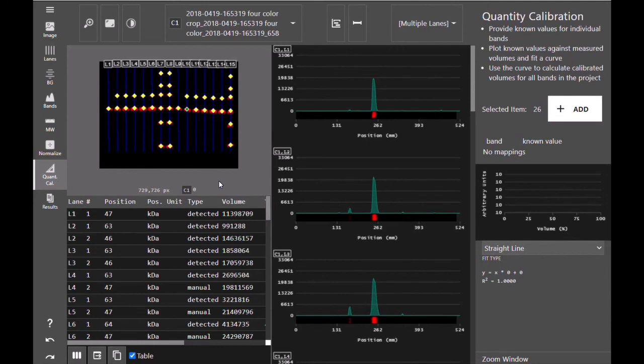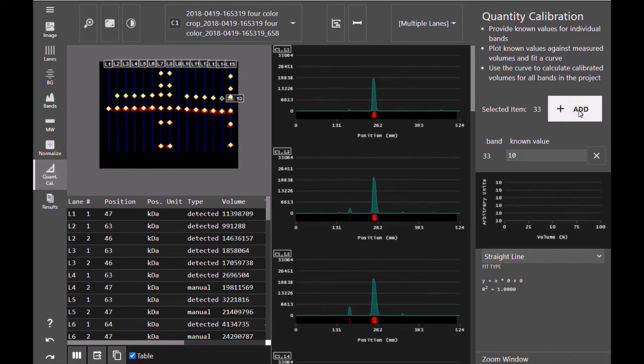To enter the values of your protein, you would select a band, add it, and enter in the known value of that band.